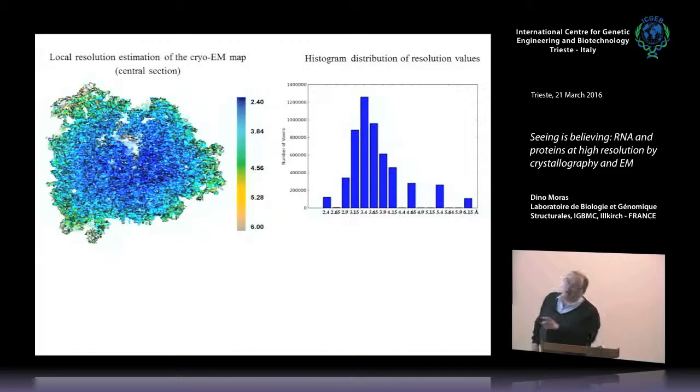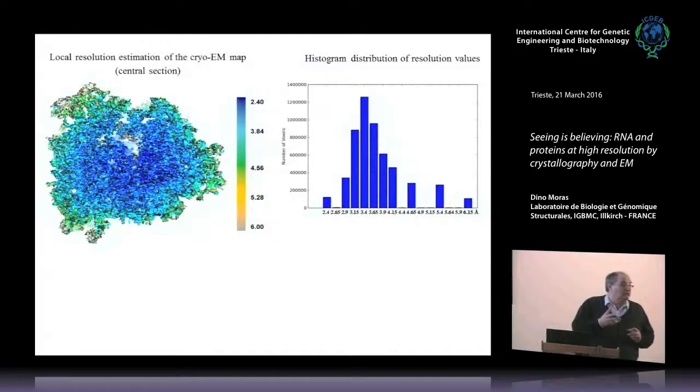So you see the inner core here, which is what you have as the more common feature and not a different equilibrium, but because when you select, you can go up to an infinity of conformers. So you limit yourself at the level that you can handle, that is averaged. So when you average different conformations, when there are things different, you have an average. So you have lower information. This is, you see, the other one.